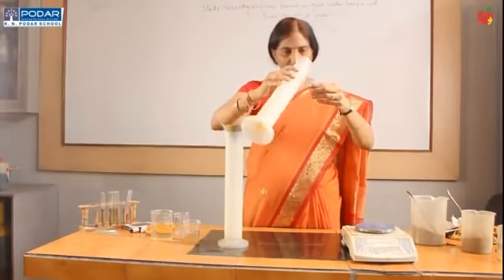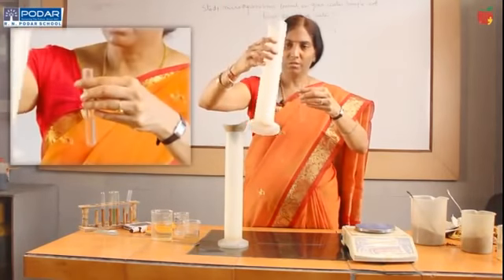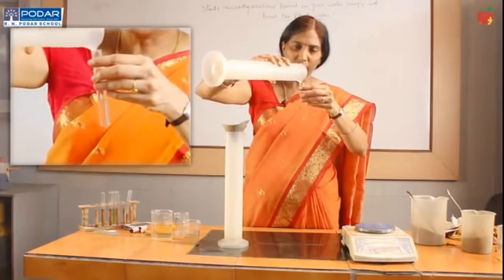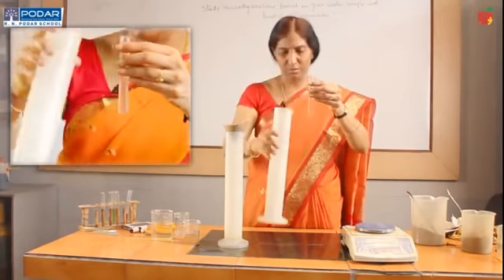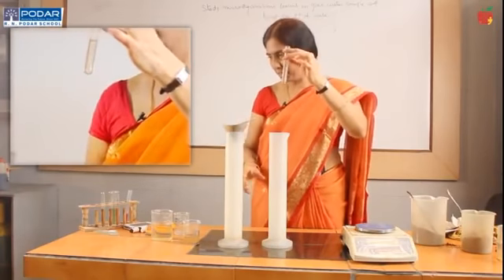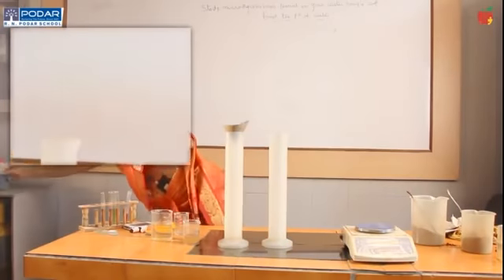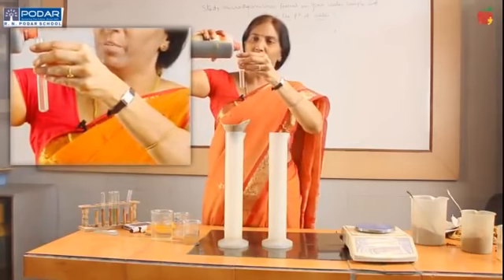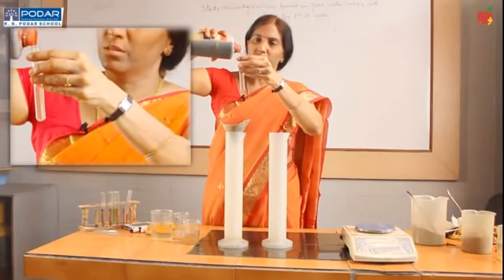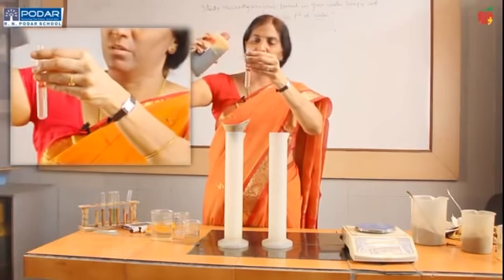Let us start. I am taking a soil solution from the first measuring cylinder. I am going to test the pH of this garden soil solution by adding 1 drop of pH indicator, or you can do it with pH paper also.